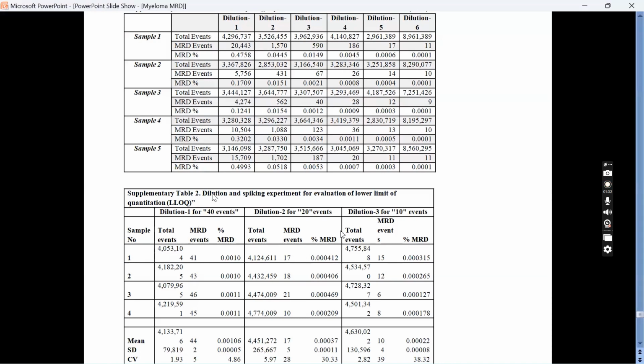Sir, isn't it that you have this dilution where you are getting 40 blast events? I thought they can choose that dilution and then do it repeatedly to get the CV. Like serial. Yeah, because when they are doing dilution, it is not following the dilution rule, of course, because as you said, 20,000, then it became 1570.